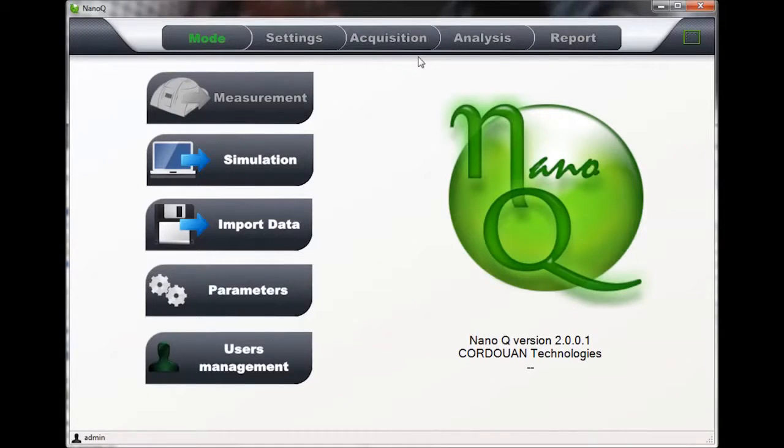NanoQ proposes three main operating modes. The measurement mode which allows starting a measurement in few clicks either in a continuous way or in a multi-acquisition session for size kinetic study. The simulation mode with a unique and proprietary function to help users interpreting their results and optimizing their measurement settings.